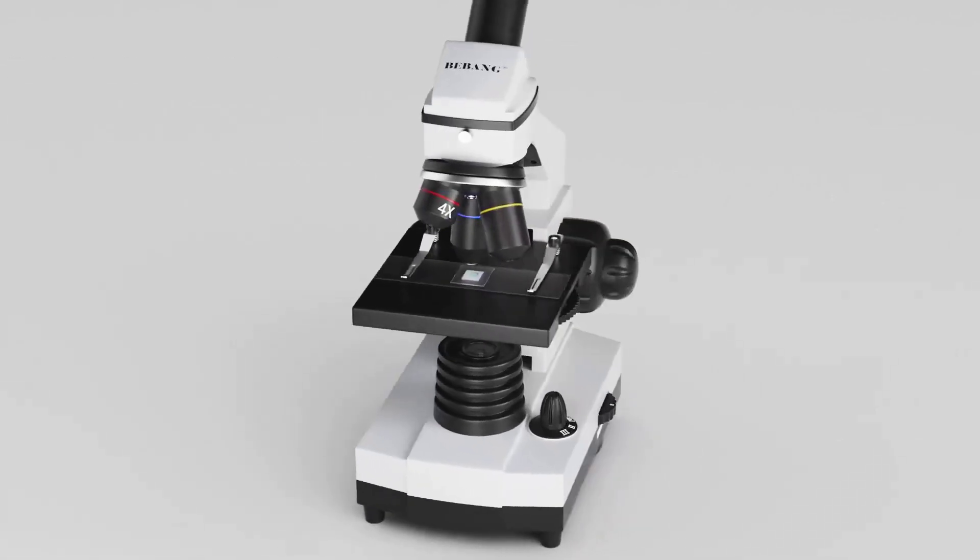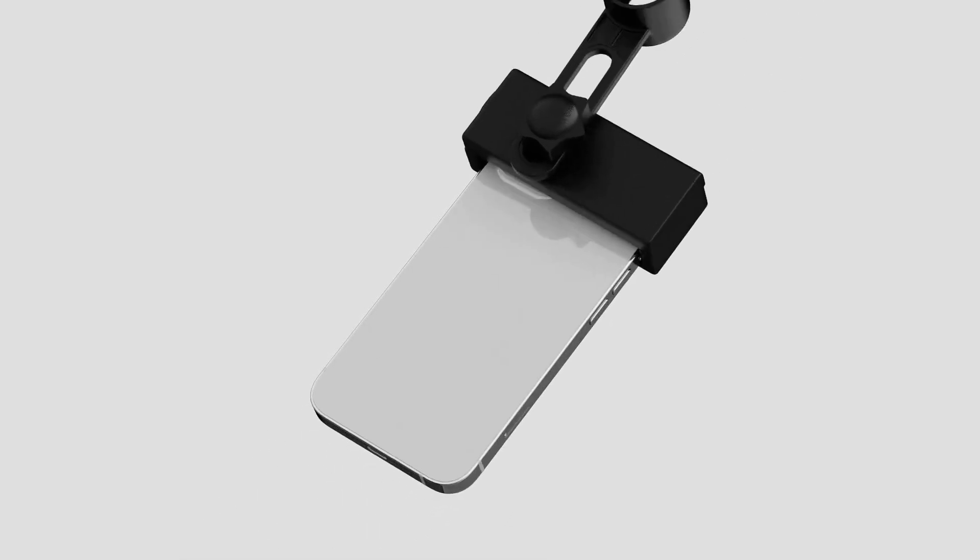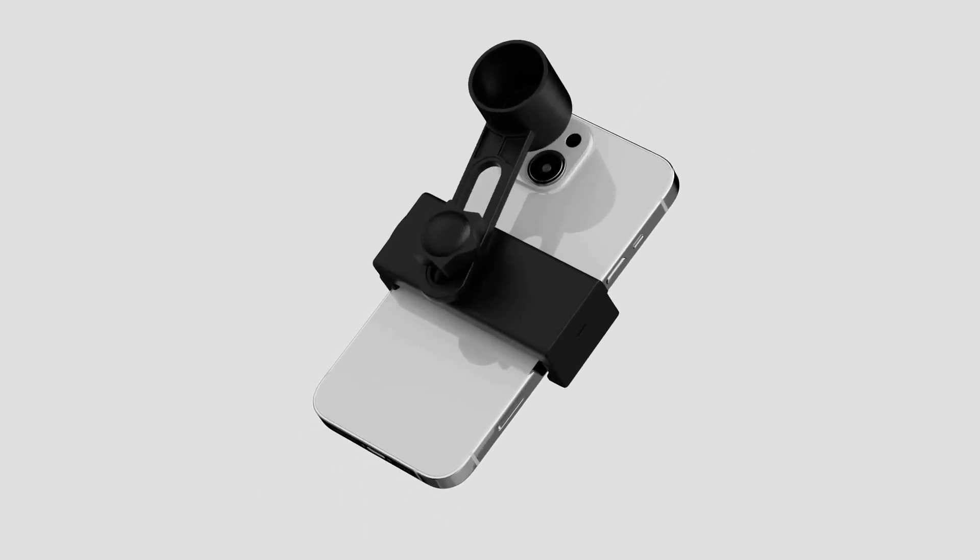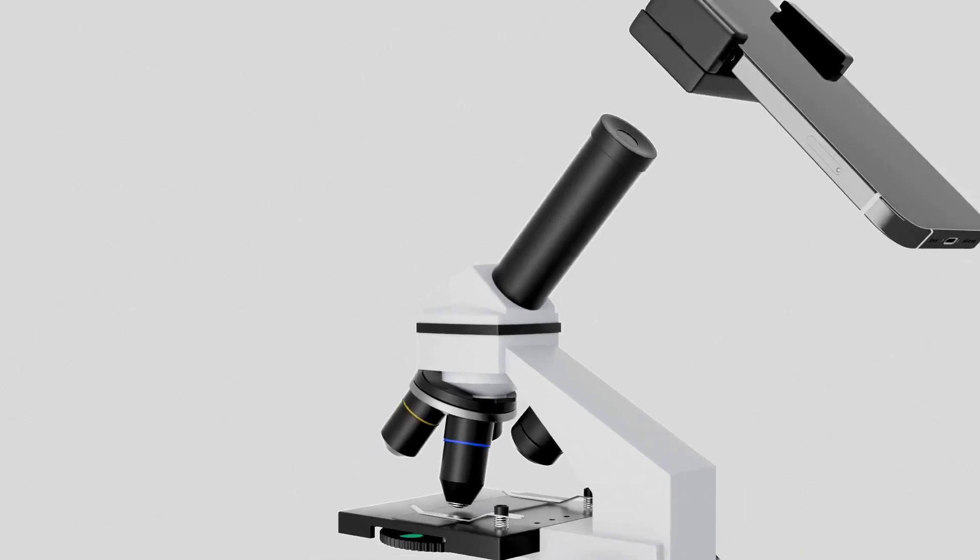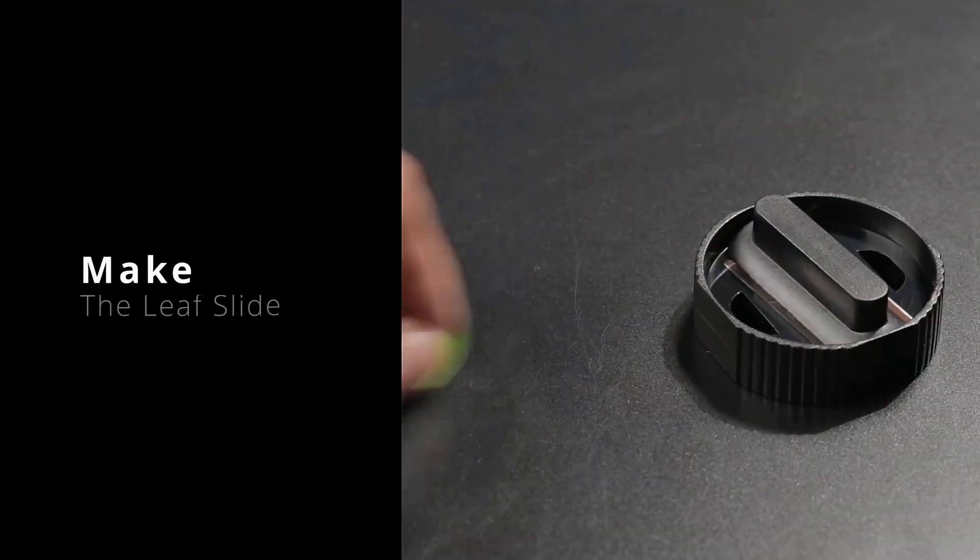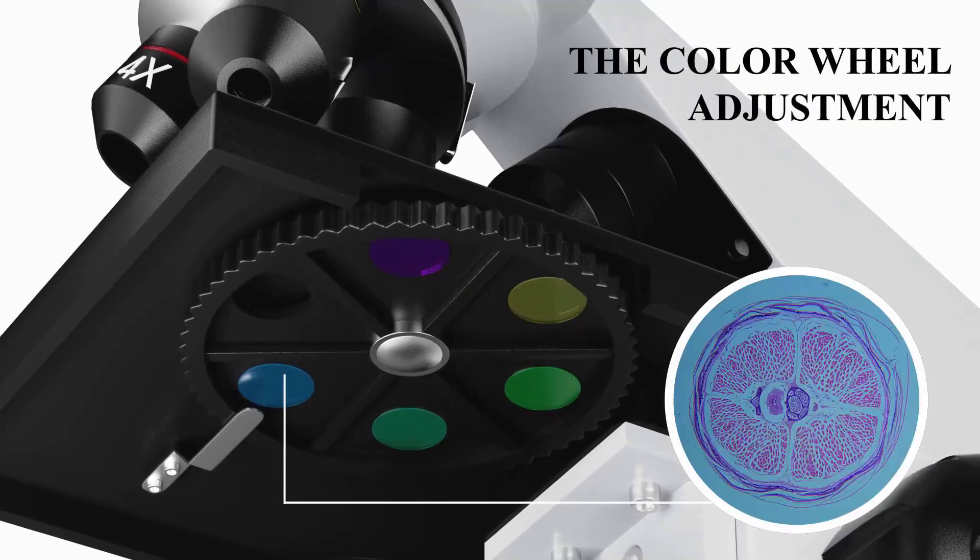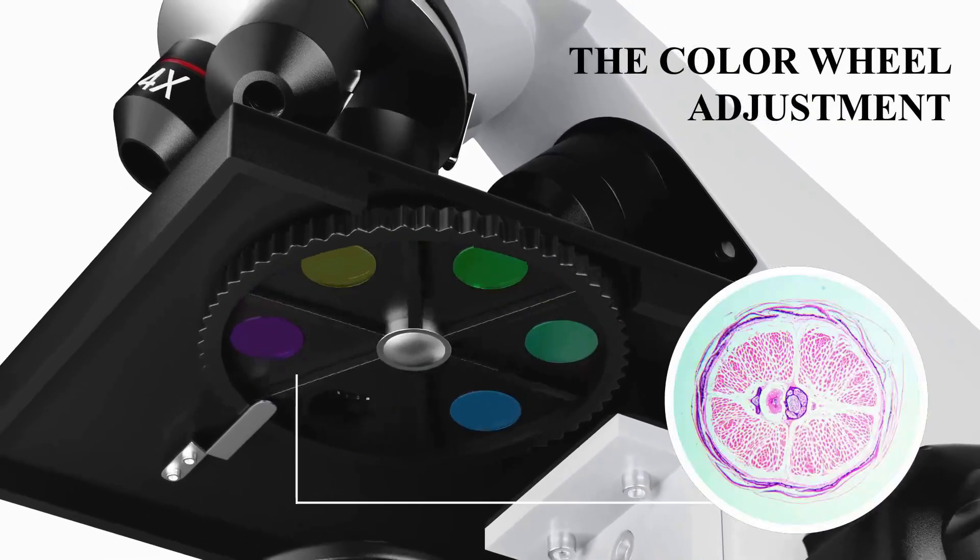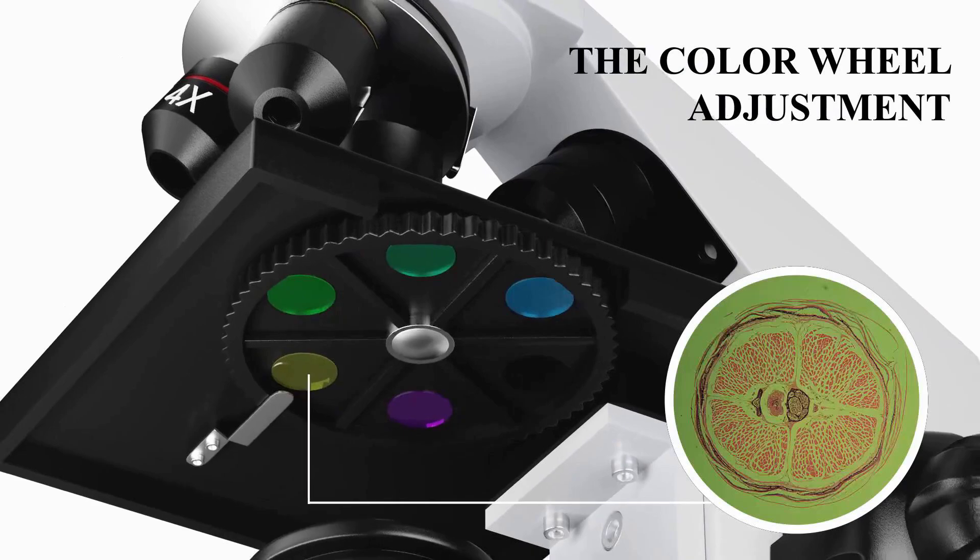A significant advantage of this kit is its completeness. It includes a phone adapter which, while requiring some patience to align, allows for easy image sharing. The included carrying bag adds to its portability, making it ideal for field trips or classroom use. The phone adapter can be a bit tricky initially but becomes quite handy once mastered.